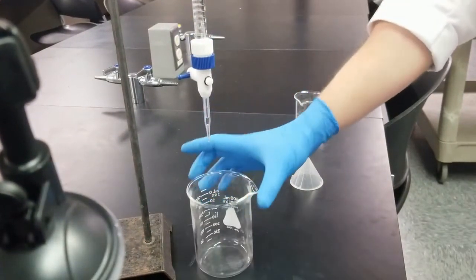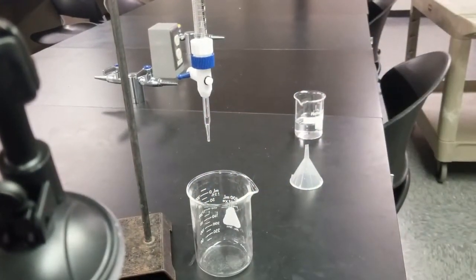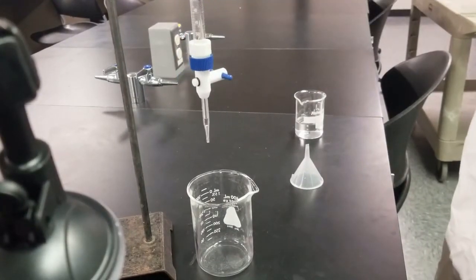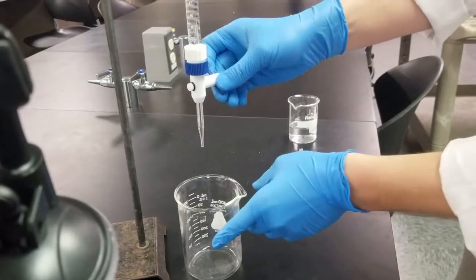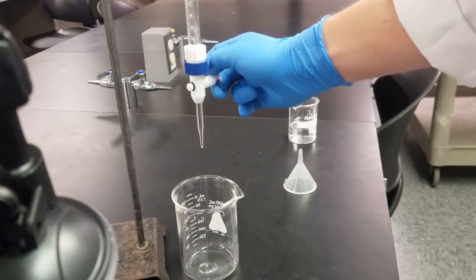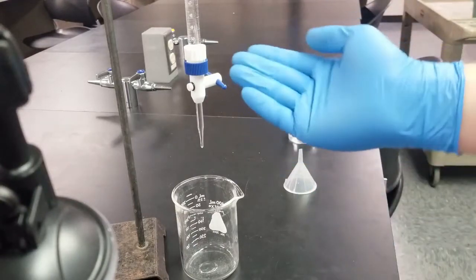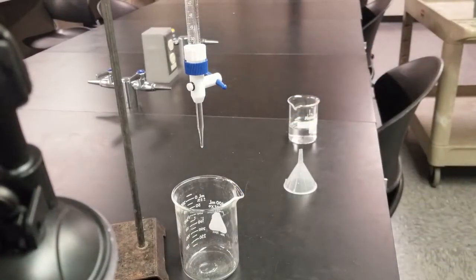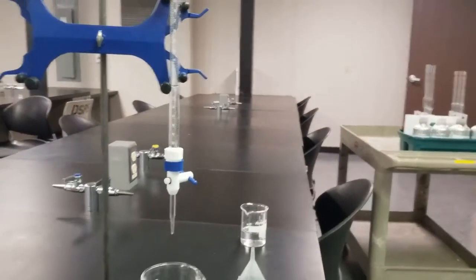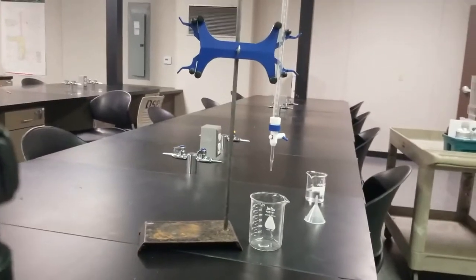You can see I've got a bit of a waste container down in the bottom, and then I'm just going to let some of the silver acetate run through. That way everything in here is silver acetate and not water or dry gunk or anything like that. So cool, that should be fine. The tip of my burette is now conditioned. Now I have to condition the rest of this volume up here. So let's take a look at how I'm going to do that.